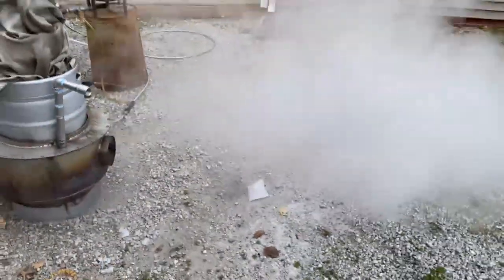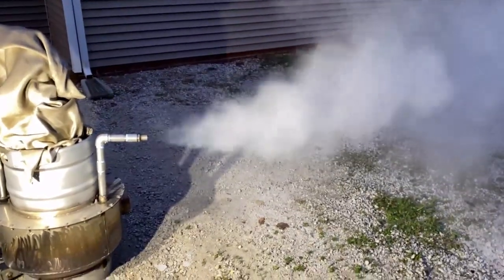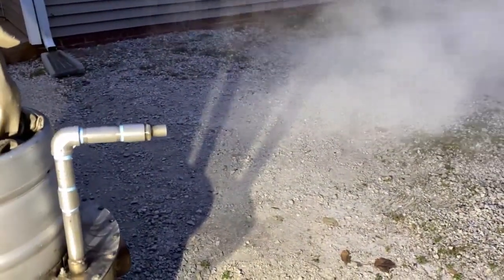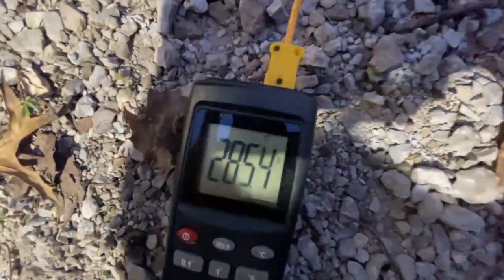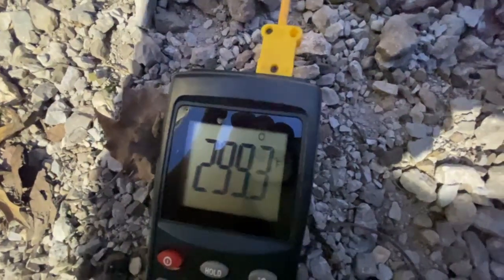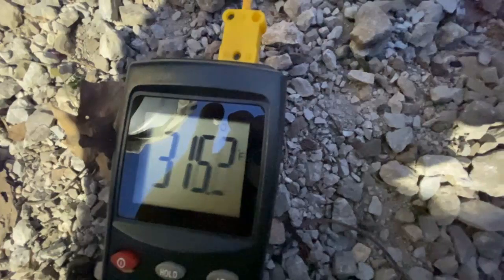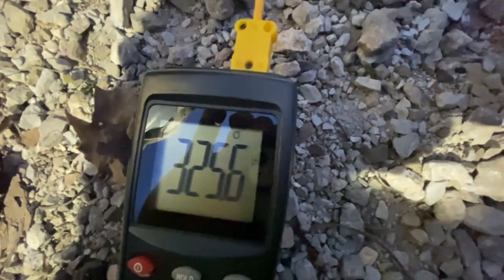Here we are at 169-170 Celsius, that's right around 330 degrees Fahrenheit, and we're not fully heated up all the way yet. Actually, we're probably about as hot as we're going to get down there — this thing is putting out some seriously hot steam. The cool thing about this rig is you can run a zero-pressure steam system without worrying about blowing the boiler up. I am going to put a pressure relief on it nonetheless in case calcium deposits clog it up down the line.